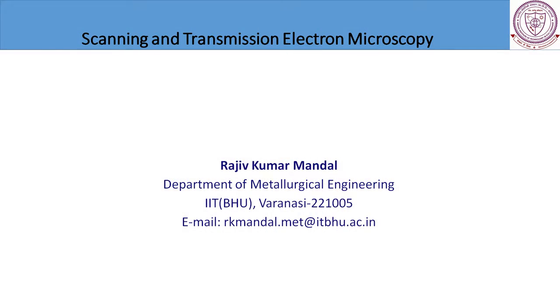So we are going to discuss today scanning and transmission electron microscopy. So we are going to the next slide now. So what electron microscopy is all about is that you are going to use electron as a probe.